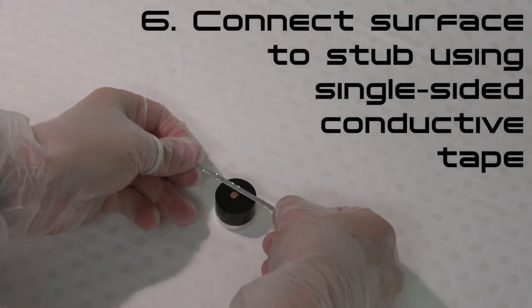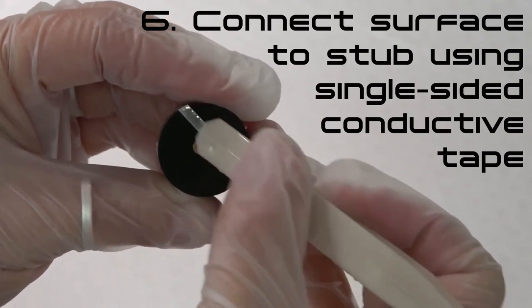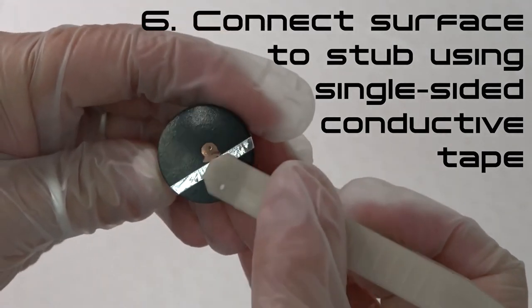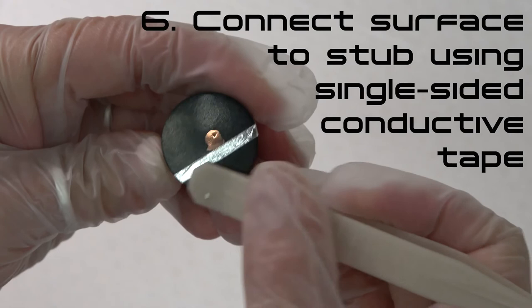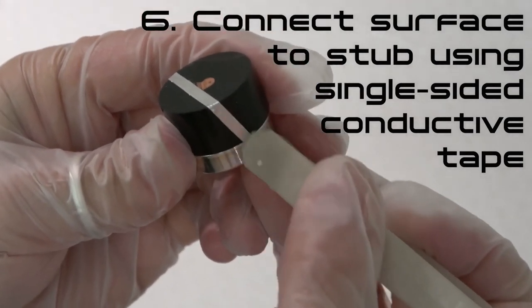Step 6: For resin-mounted samples, connect the sample surface with the SEM stub using single-sided conductive tape. Ensure that the tape makes good contact with the surface, including at the edges. Do not place tape on or near an area of the sample that you wish to examine.